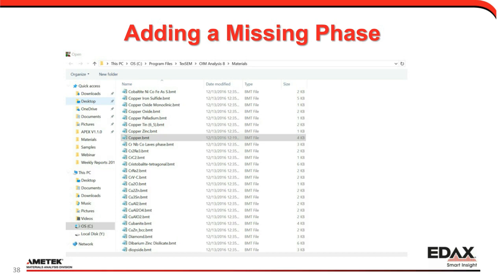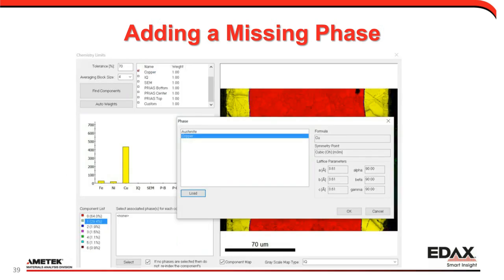Let's see, I actually think I just saw a really good question. Historically, we have used different sample setups for geometries for EBSD and EDS, especially for quantitative EDS. How good is simultaneous data collection? I assume this is all done with EBSD tilted geometry. Now, this is, again, a very good question. Anytime we're doing EBSD data collection, we're doing it on a tilt. So if I'm doing all this data tilted, how does that really affect my EDS signal?